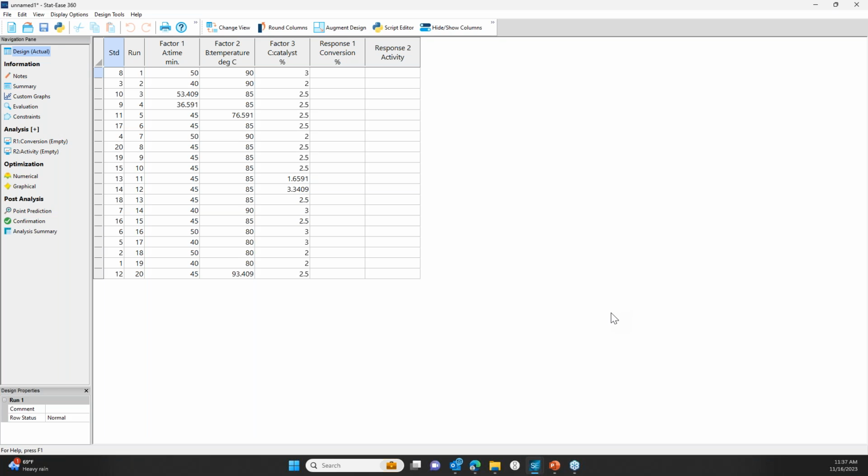The number of runs that are chosen, the way we look at it, we're going to size them for precision, which is a little bit beyond the scope of what we're going to talk about today. But as a general rule of thumb, response surface designs will be large enough that you don't need to be terribly concerned about sizing them. Although, never say never.